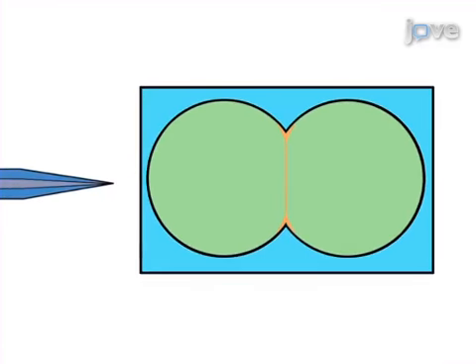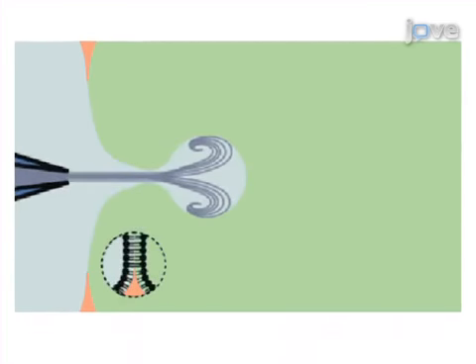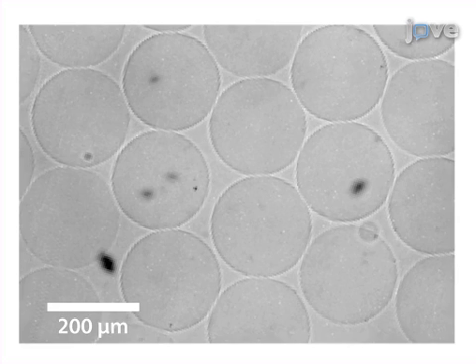Next, an inkjet containing the solution to be encapsulated is set up with the jetting apparatus. Once the appropriate settings have been established, jetted fluid pulses will produce lipid bilayer vesicles. Ultimately, microfluidic jetting yields repeatable, monodispersed bilayer vesicles.